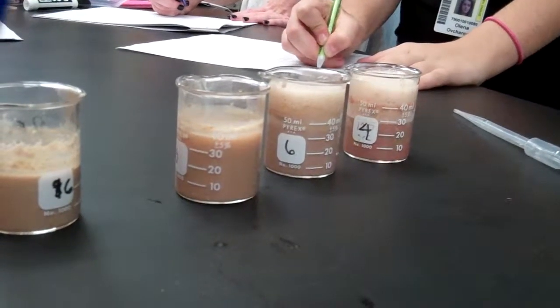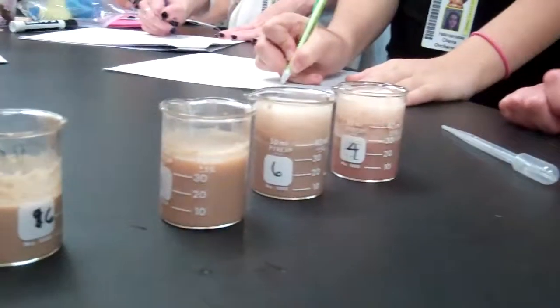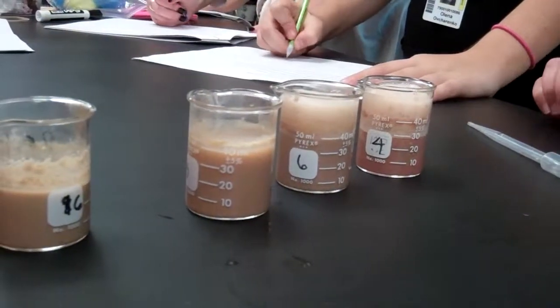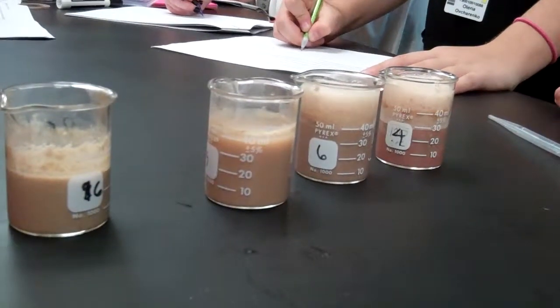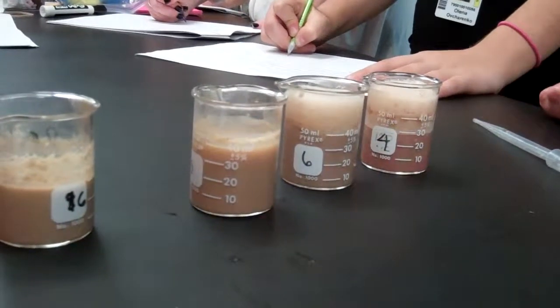Same thing. That's the same thing. Is it as big as this one was? Okay, so make sure you write that down. Is it still an exothermic reaction?